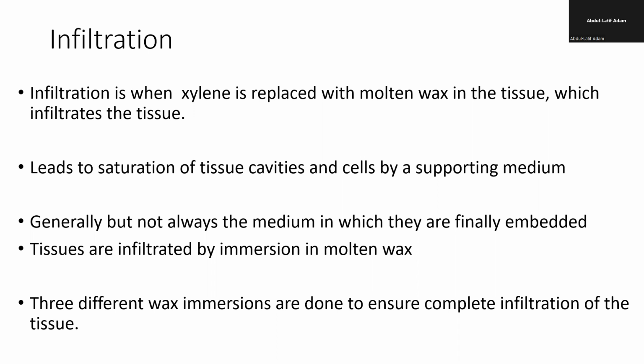Then it will become infiltrated. And the factors that affect tissue processing are temperature, agitation, vacuum, and viscosity. All those things also influence penetration, because if you don't allow the wax to melt completely before you introduce it as an infiltrating medium, you will not be able to penetrate and fill up.